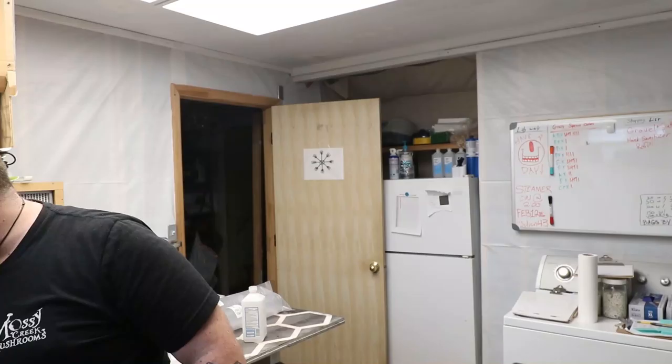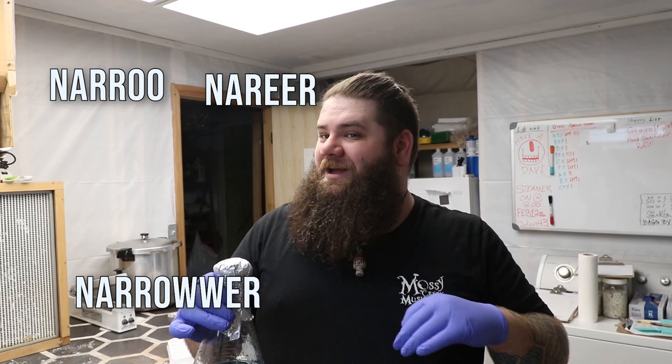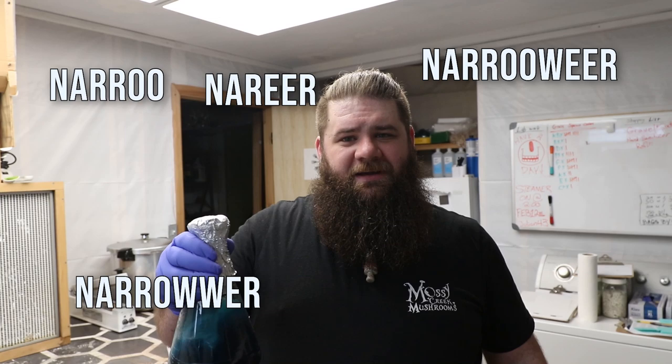I want to talk for a moment just about the Erlenmeyer flask. I've seen a lot of people on YouTube and other places talking about using polypropylene pitchers - it obviously works for them, so if that's your thing, go ahead. I'm just not that way. The big reason a lot of people say to use pitchers is because they're made to pour. But a flask is also made to pour - it has a narrower opening.